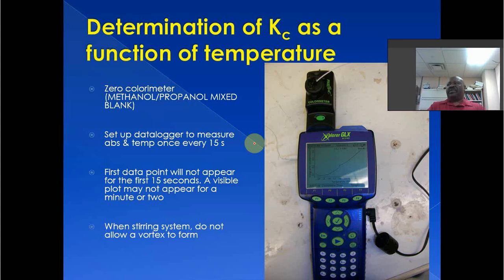So then let's perform the experiment. We want to determine Kc as a function of temperature. So we're going to change the temperature. So make our equilibrium mixture. What does that consist of?